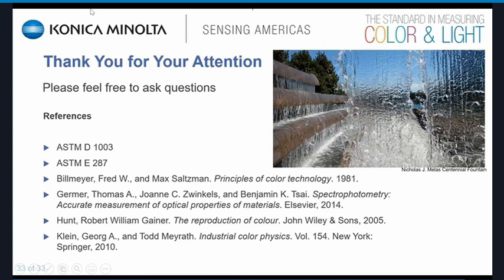Sure. Vinyl tubing, like that would be used in medical applications, is a good one because in the medical industry, you want to make sure that any IV drips or liquids that you're looking at appear consistent every time. It's also used in quality control for films that might be used for packaging. And it's widely used across the plastic industry. ASTM D1003 is actually developed for plastic, so you can think plastics such as acrylic and polycarbonate that you're trying to match the clarity of glass. And it could also be used as a metric in glass, too.